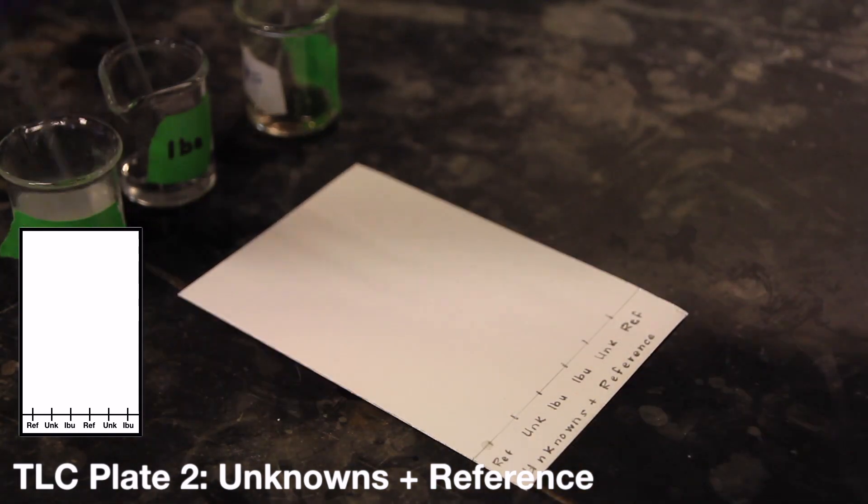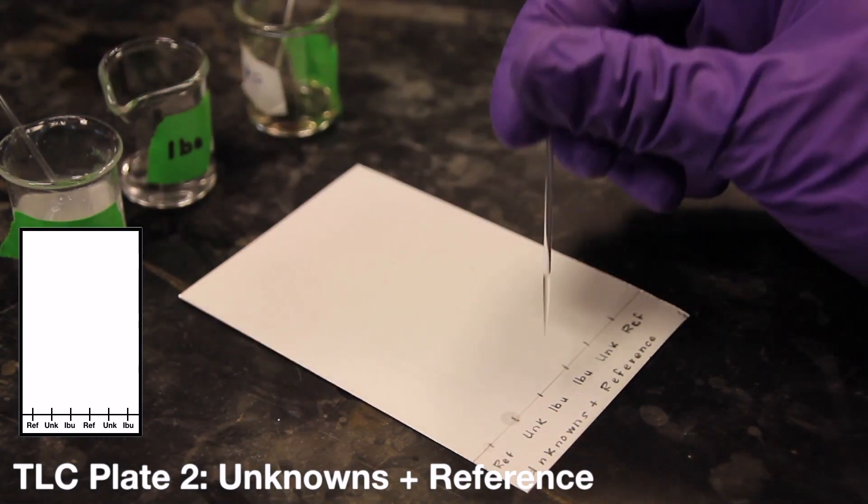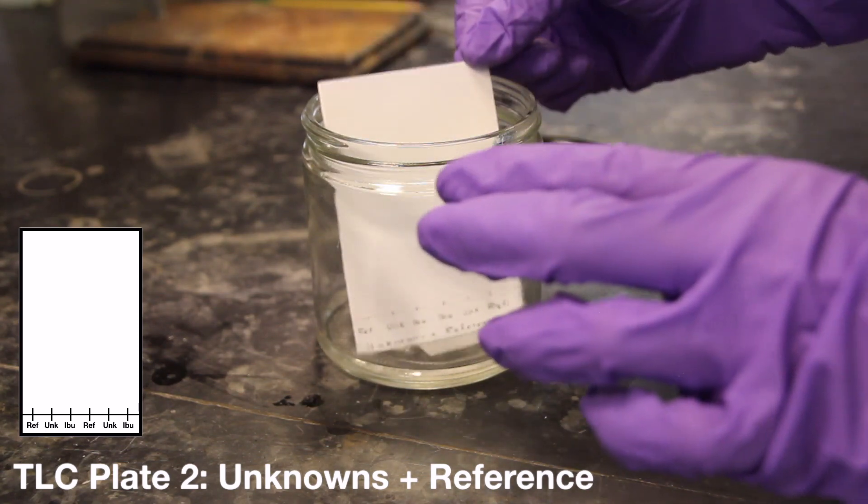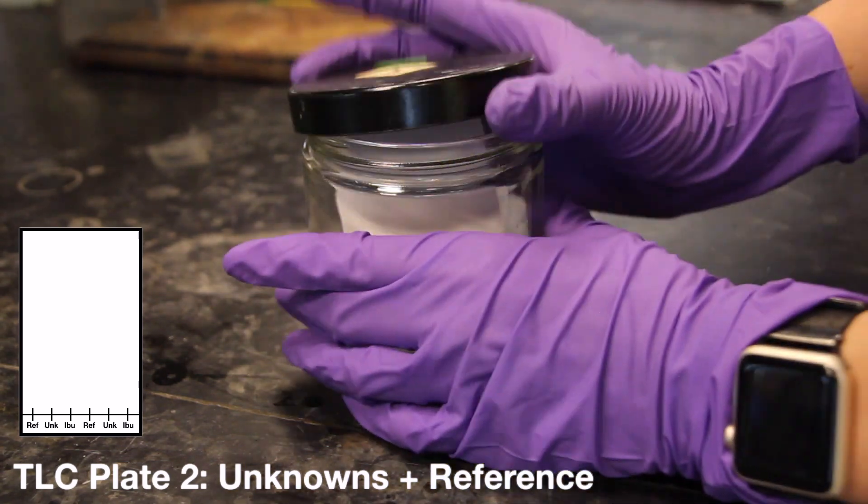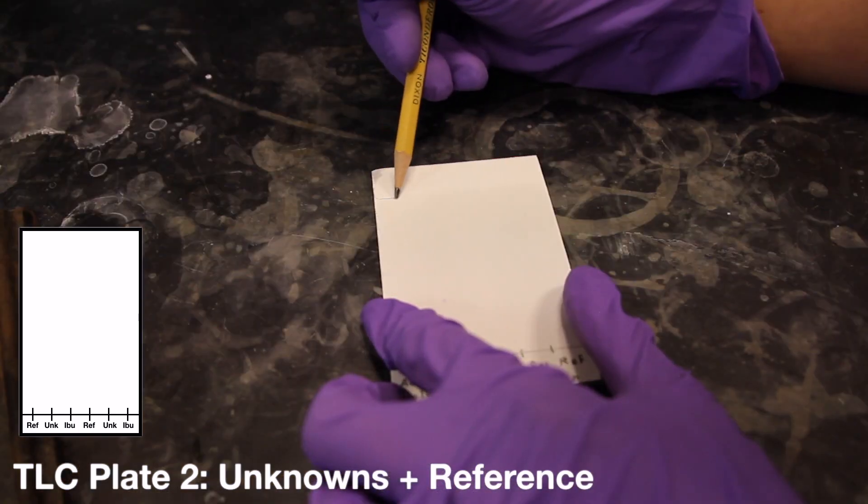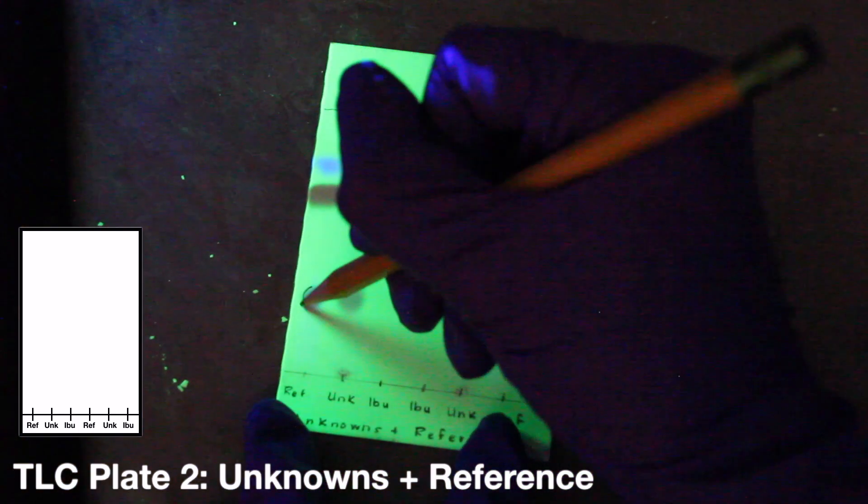The extra slots on your plate can be used to spot the unknown and reference mixtures a second time. Once your second plate has been spotted, develop it in a TLC chamber using 2-butanone as your solvent. You are going to follow the same procedure as before for visualizing the spots after chromatography and calculating the RF values of each spot.